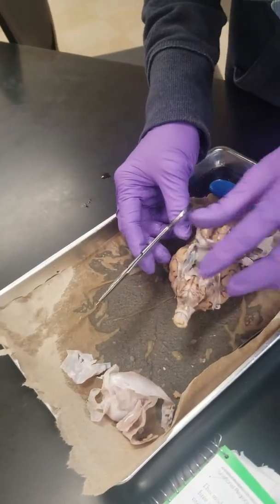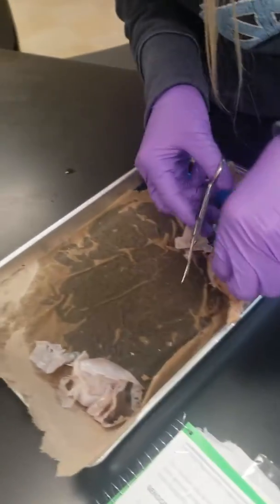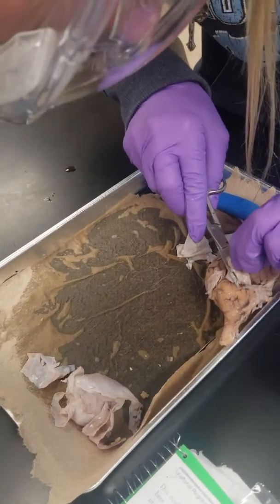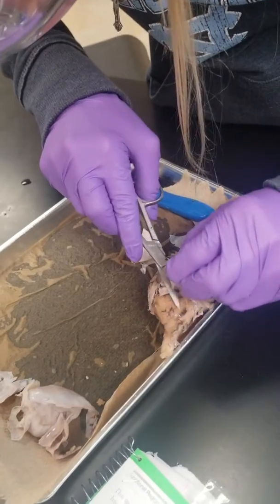So we've got the dorsal portion. Now flip over to the ventral. You're going to start to identify the structures and let's start to see some of these structures.